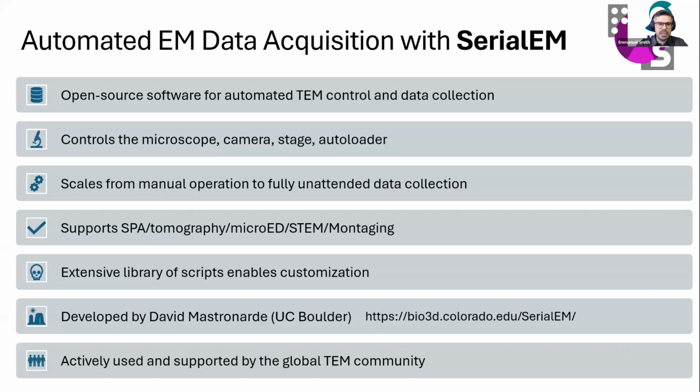Now, just to review SerialEM, it is, of course, an open source software for automated TEM control and data collection. It controls the microscope, camera, stage, and autoloader. It scales from simple processes and manual operation all the way to fully unattended data collection that could span days to several weeks if needed. You can do all sorts of experiments with it: single particle, tomography, micro-ED, STEM, and montaging.